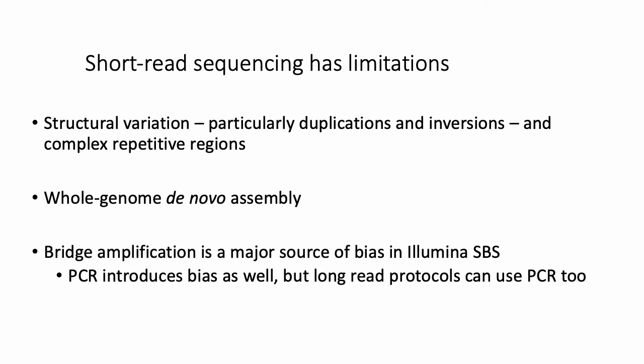But basically, when you have a reference genome and you're sequencing a new genome, and you want to detect events like duplications or inversions, you typically need reads that span the boundaries of, for example, where the inversion happened in order to actually detect it. Having reads that span these boundaries is easier when you have longer reads. That'll become more clear in the next few slides.